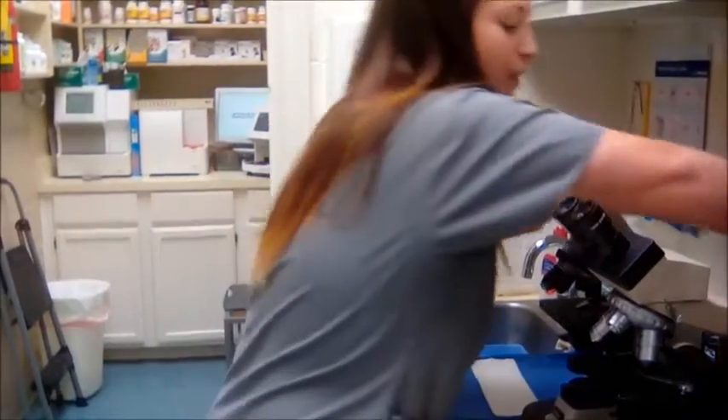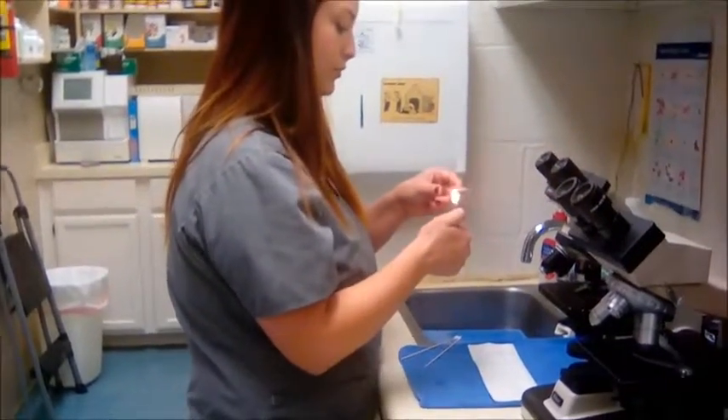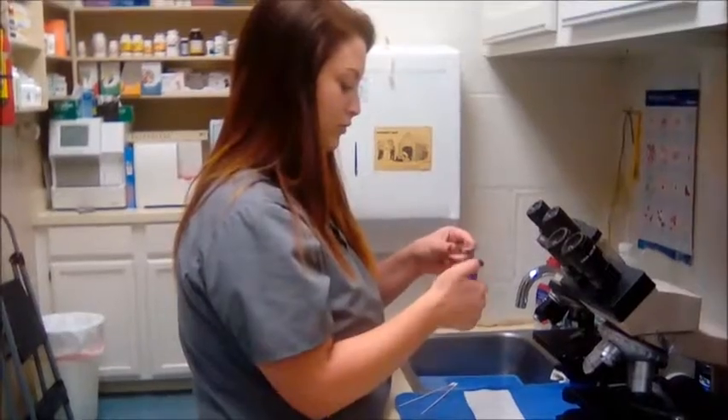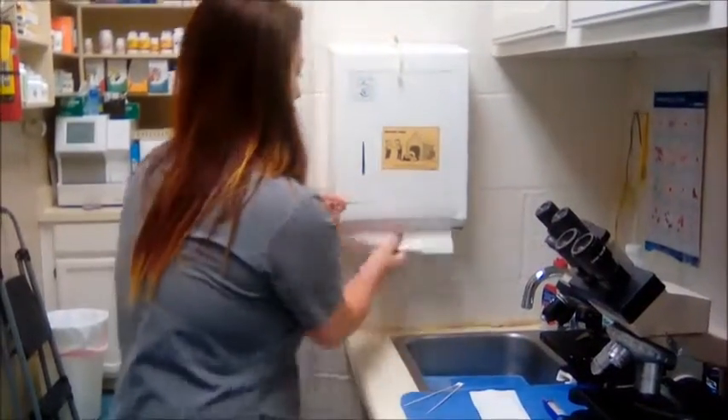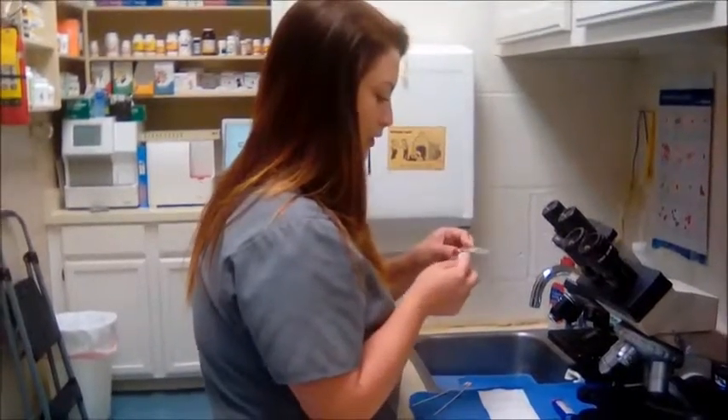Okay, now I'm going to take my liner and I'm going to heat set the sample and I'm just going to wipe off the back of it.